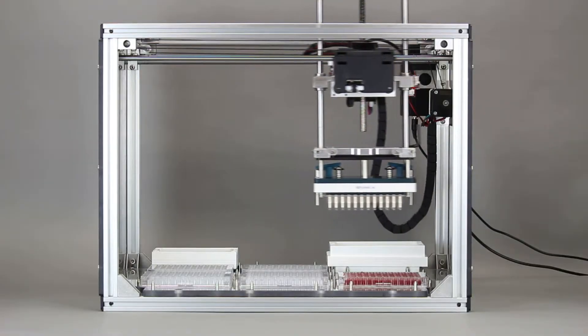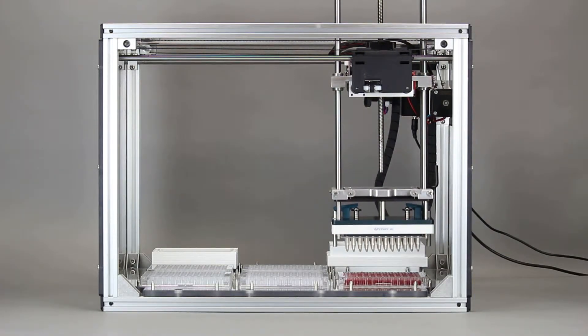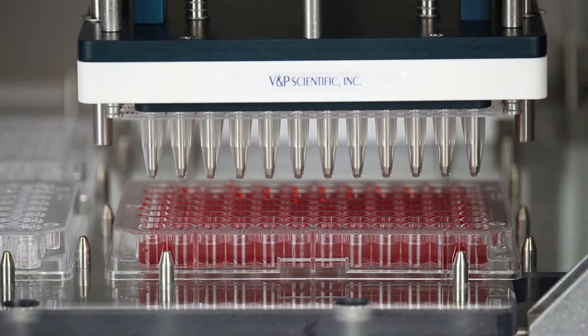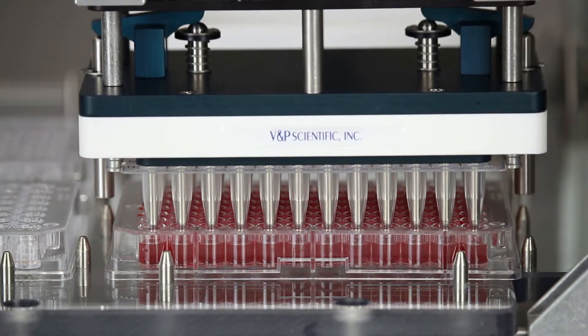Once loaded, you can now start the assay. The Magpin R is slowly inserted into the wells containing the magnetic beads.